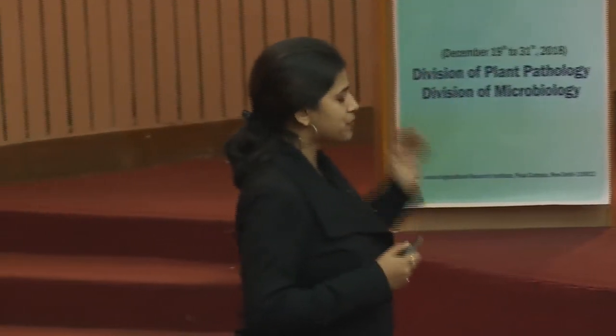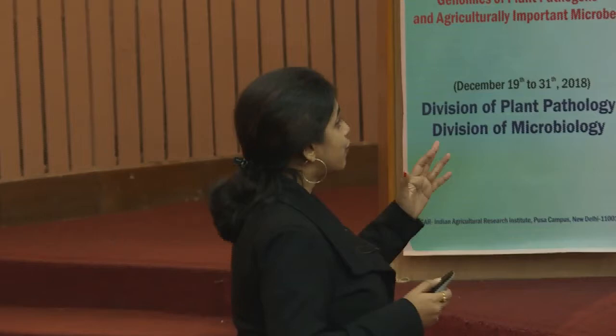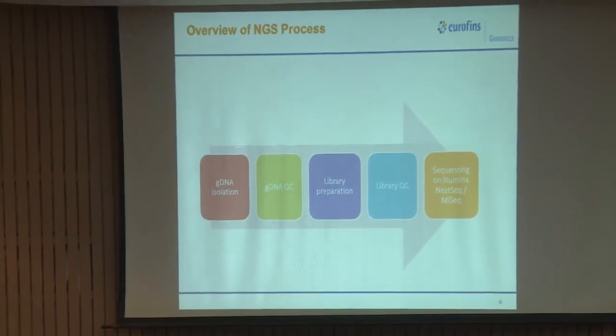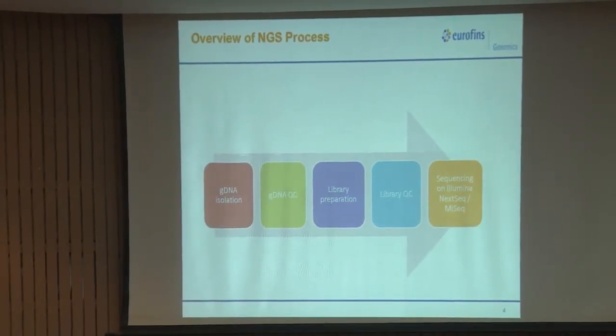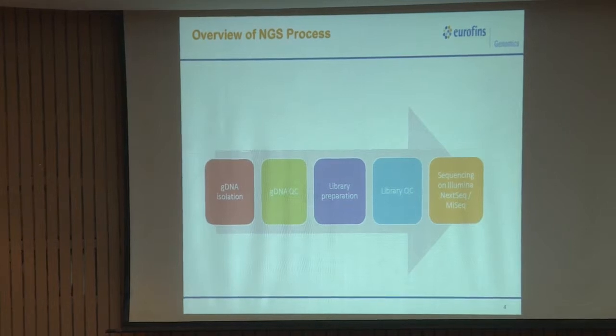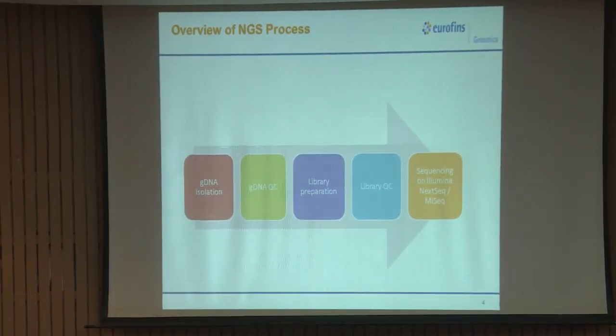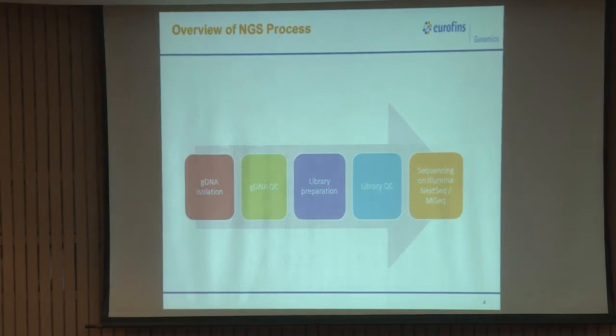So, when the library is prepared and the DNA templates are attached, we do a QC. Why do we do a QC? We want to see what is the length of my DNA template, right. Is my library a proper size or is it out of size? If, for example, I am sequencing 2 x 150 and I have a library size of 1000, I will have a huge gap between the two ends, right. We have paired end sequencing. Paired end means I am sequencing from forward and I am also sequencing from reverse, the DNA template.